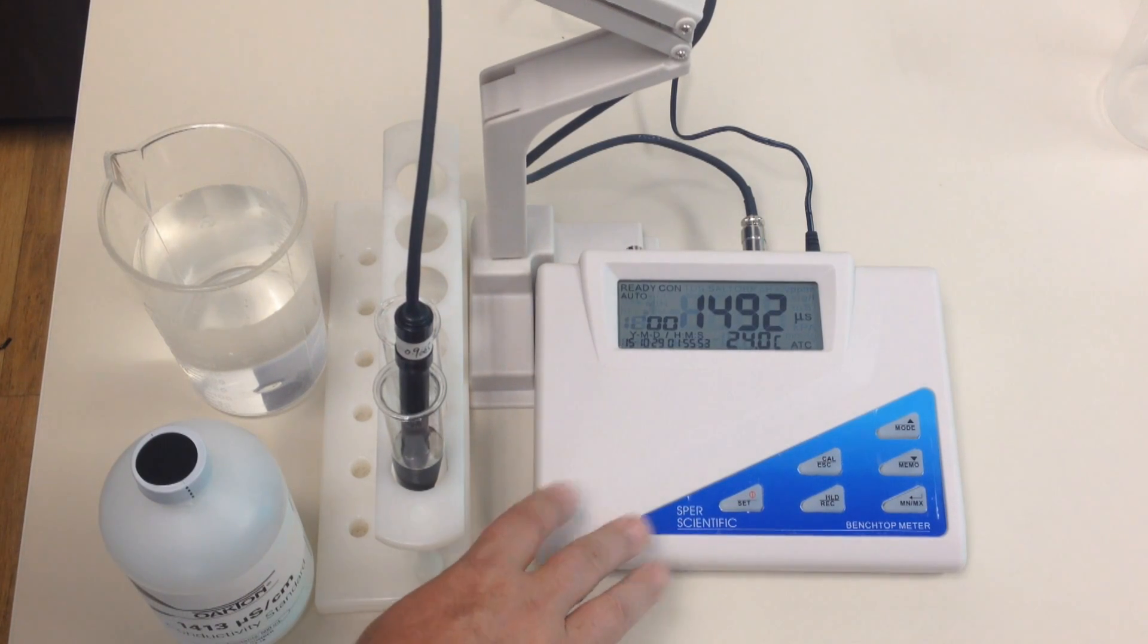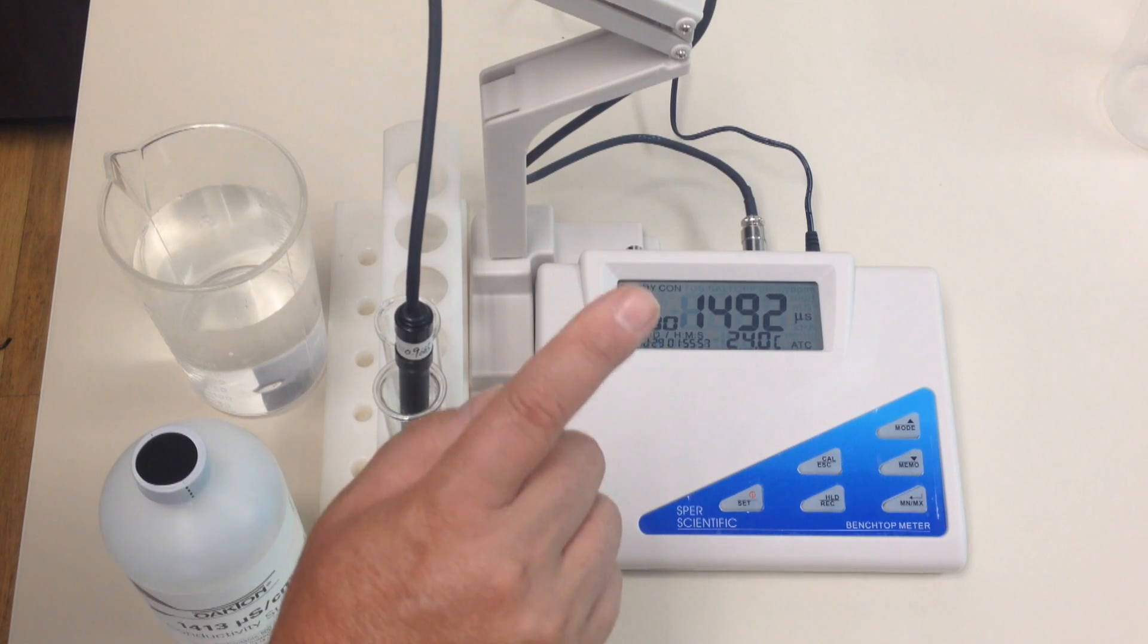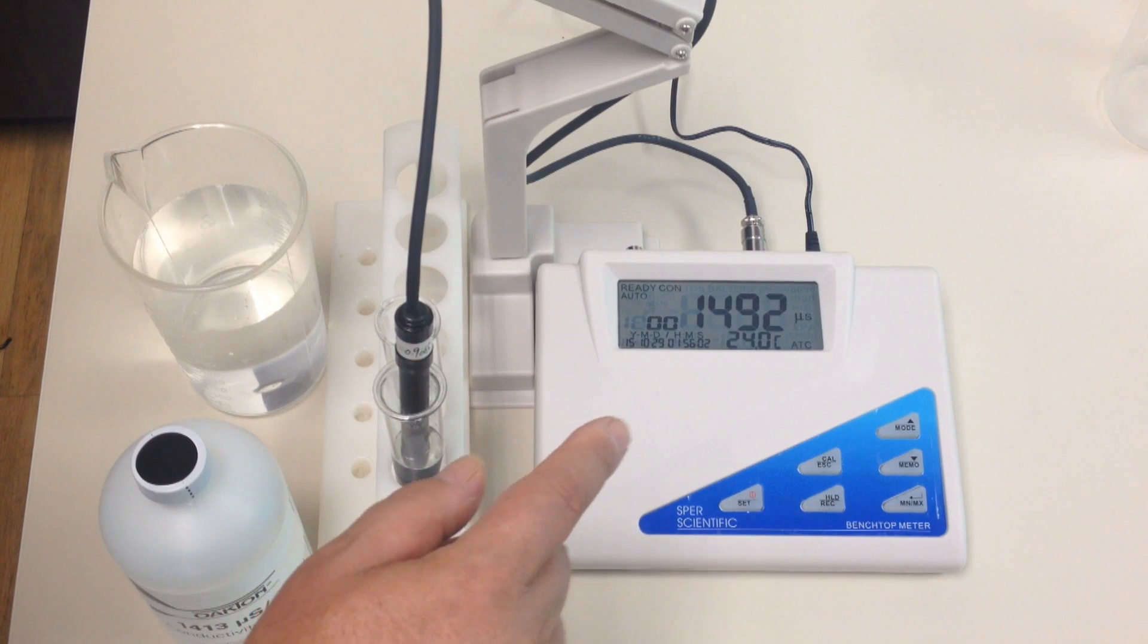I do want to point out, any time you calibrate the unit, this unit does five different ranges, you are only calibrating one of those ranges. And when it resets just that one range, it doesn't reset all five ranges.